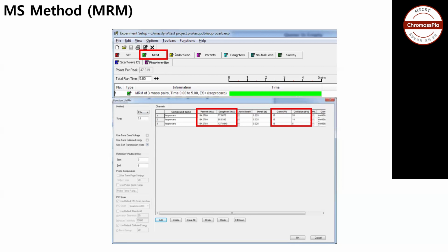Actually, the three different collision energies mean that each collision energy makes its product ion the highest intensity. You are asking how it works, like one scan will be 28, another scan will be 14, and the third one will be 8. Is it like that?